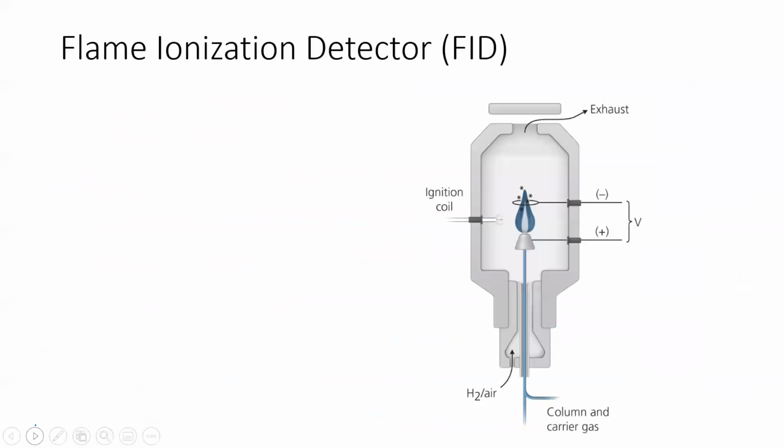All right, so we're going to talk about just a couple of different kinds of detectors. The textbook goes through, I don't know, maybe 7 or 8 different kinds of detectors, and gets sort of into some little nitty-gritty details that are interesting, but not always applicable.